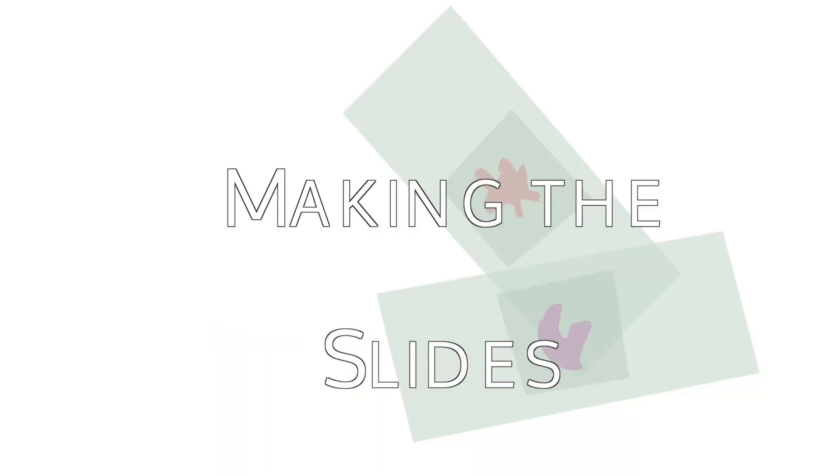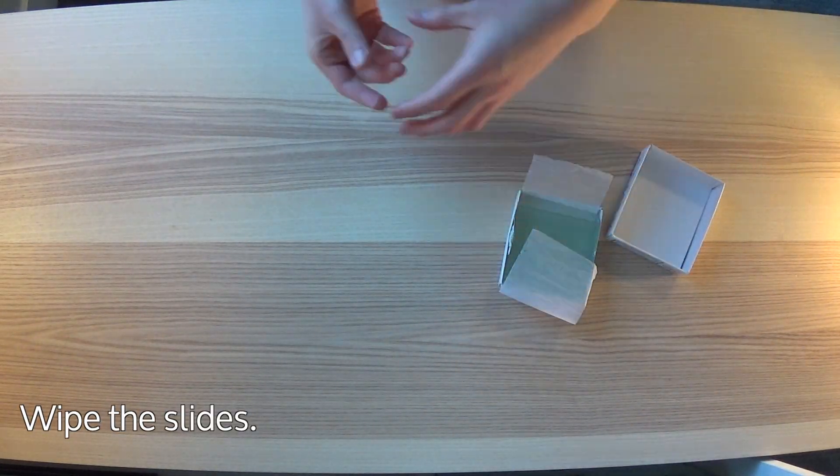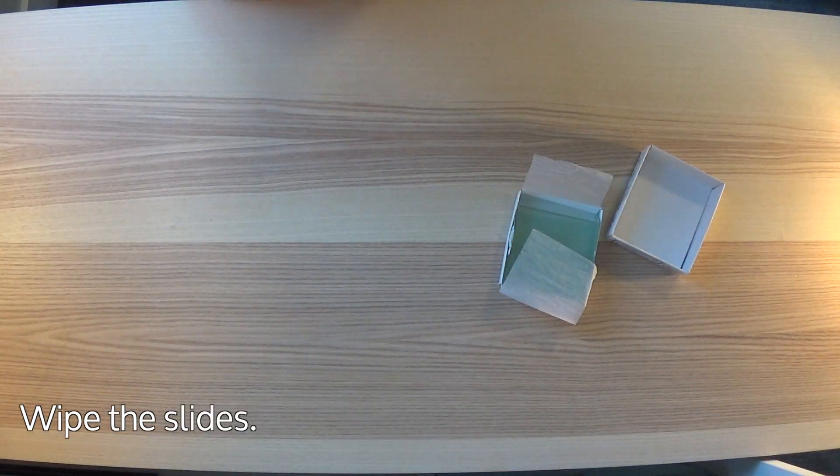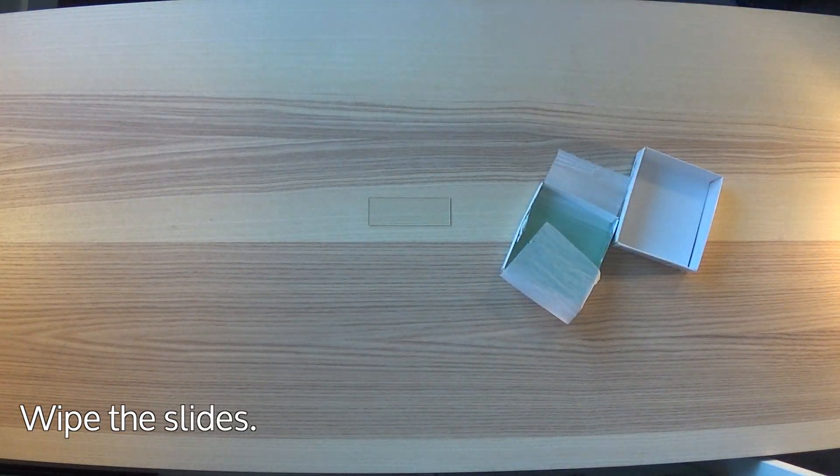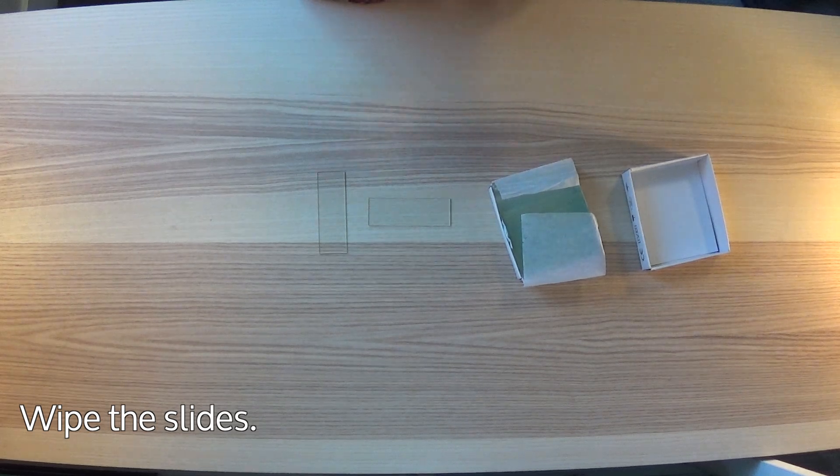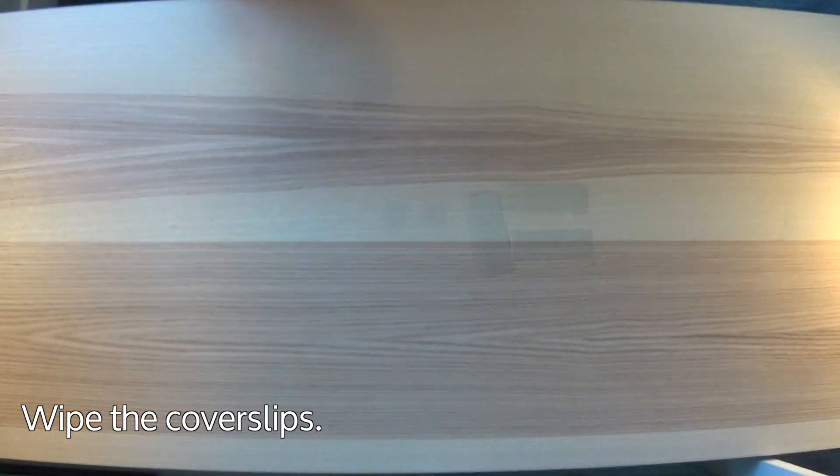Making the slides. Wipe the slides with the alcohol wipes. Do the same with the cover slips.